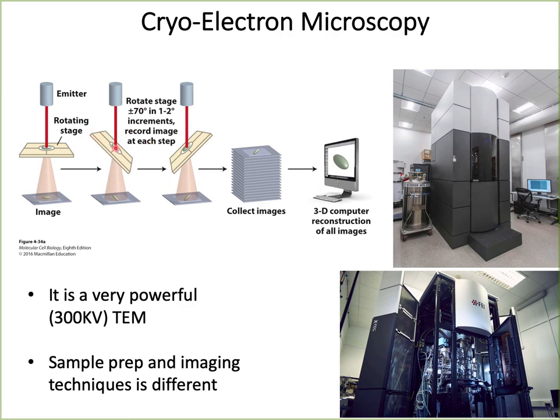When the stages are tilted, each time the detected image is going to get a slightly different angular view of the image. This is flat, just another angle, and you are going to get a lot of angles. So all these images are detected where the same particle or image is detected in different orientations.